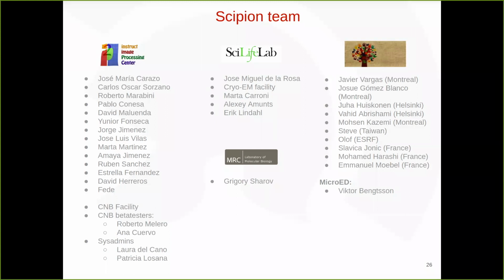And then on the right side, you can see plugin developers that are already working, developing their plugins. And we hope this list to be bigger and bigger with the time. Victor Bengtsson is the developer of the microED stuff.